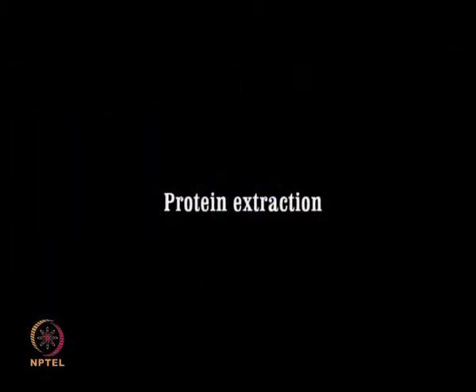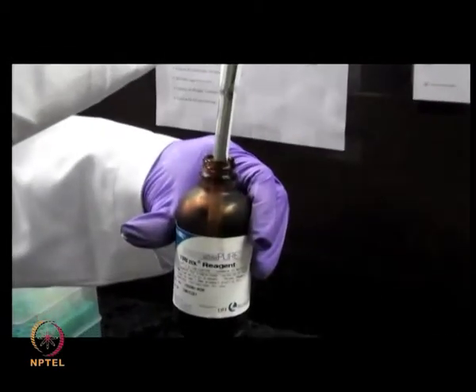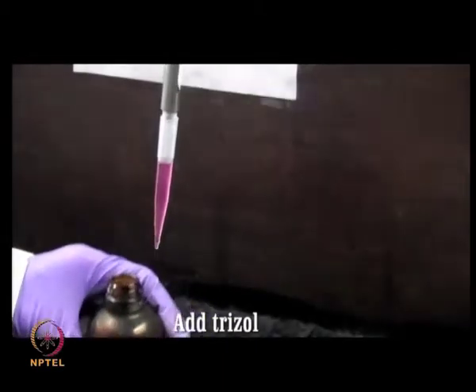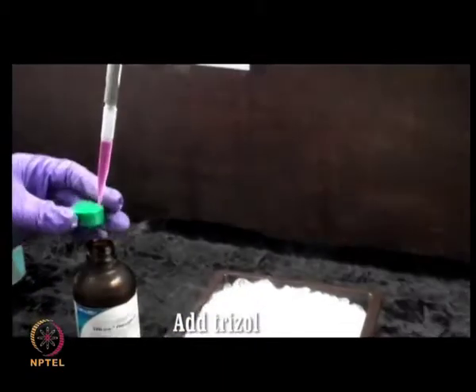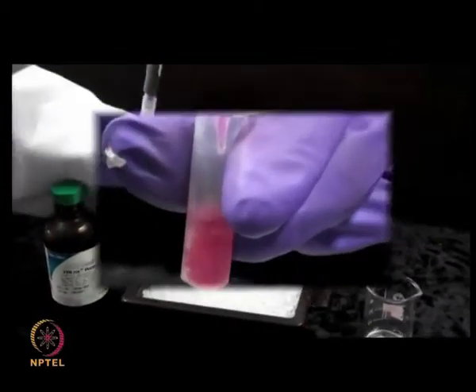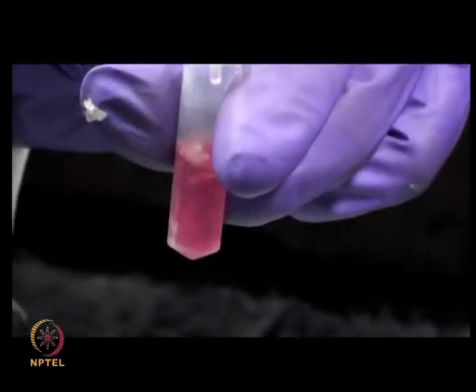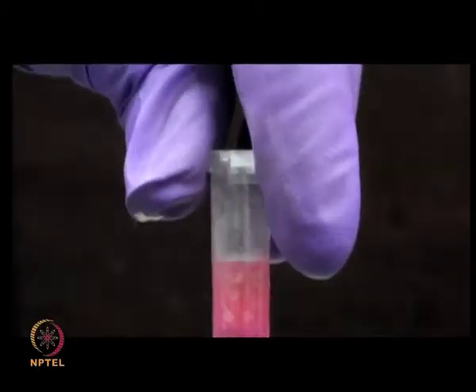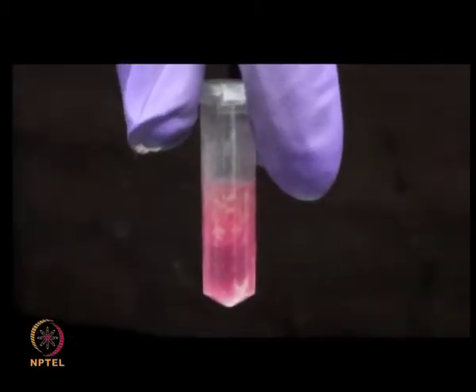Protein extraction. The Trizol extraction protocol allows efficient separation of not just the bacterial proteins but also their DNA and RNA. Add the Trizol reagent consisting of guanidinium thiocyanate, phenol and chloroform to the supernatant obtained after sonication.